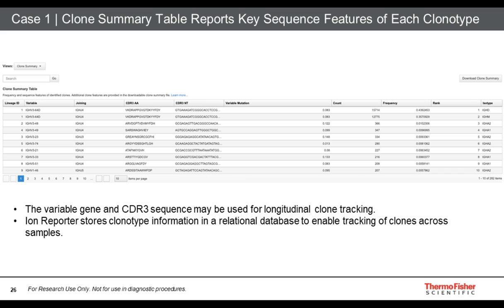And these have the same level of mutation of 8.3%. And to the leftmost portion of this table, you can note a column that indicates the lineage ID. The software will automatically assign clones to clonal lineages based on the features of that rearrangement. So you can see that the first two clones are believed to be related by descent.